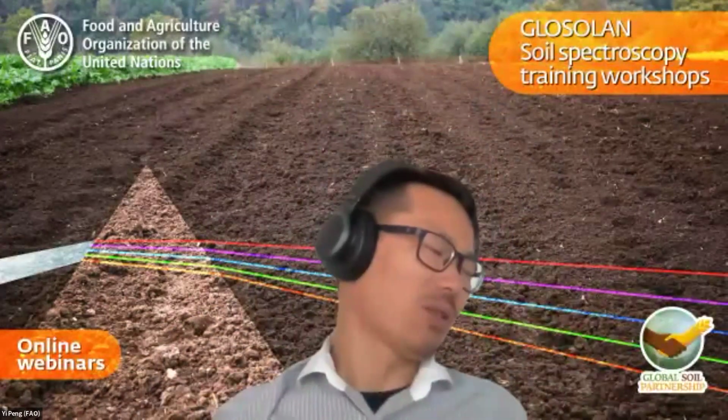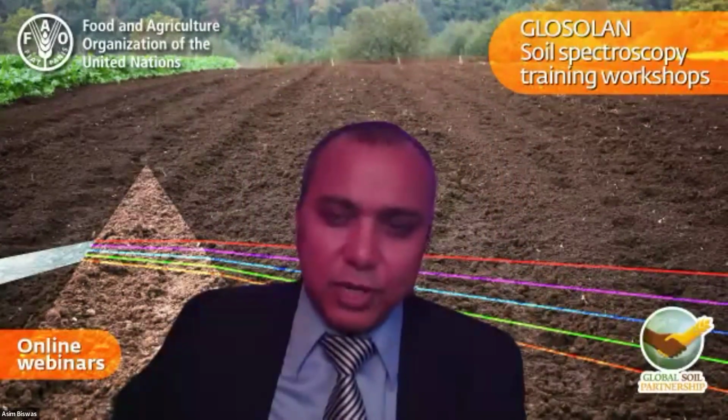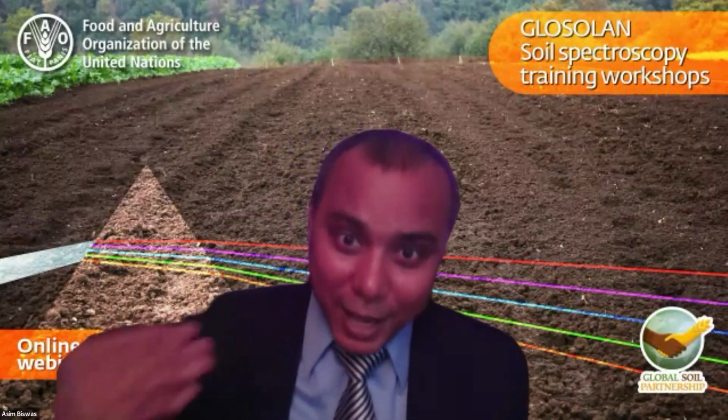Okay, thanks. I think there are quite a few different algorithms to apply. The best way is to try to apply these algorithms on your own data, and you will get the feeling. Absolutely. And there are some of the coding, and with the spectroscopy community movement and a lot of contribution from different researchers in terms of program codes and other things, those are very helpful as well. They could provide resources to work through. And these are open source programs and codes, so you don't have to pay for them. But again, it takes a little bit of time to learn. And as Pengi mentioned, if you can work through your own data, then you really learn the differences.